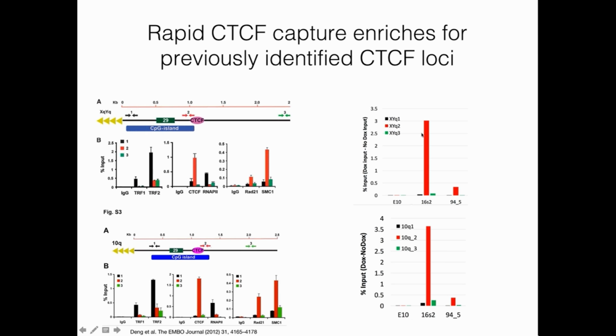So this is now done at the same time, same sample. We see an enrichment for CTCF. So we think that we've established a quick first run at this to pull down simultaneously a DNA complex and then also done mass spec analysis with this.